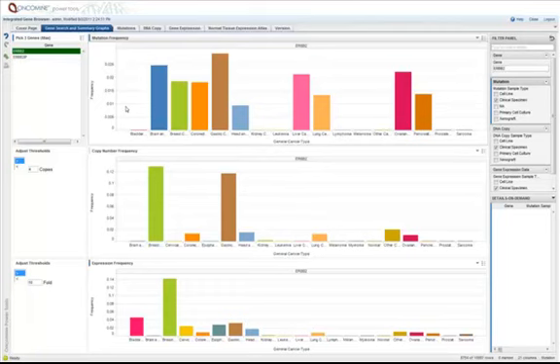So because anti-HER2 therapies' approval is really focused on HER2-amplified cancers, let's first look at the copy number data for HER2. When we set it at greater than 4 copies, what we can see is that HER2 is amplified most frequently in breast cancer. As I'm mousing over this data, you can see that our estimated frequency is 13%. I think that's a little lower than what's been reported, but this is the value that we get when we look across 645 breast cancer cases and find 83 amplifications at our threshold.